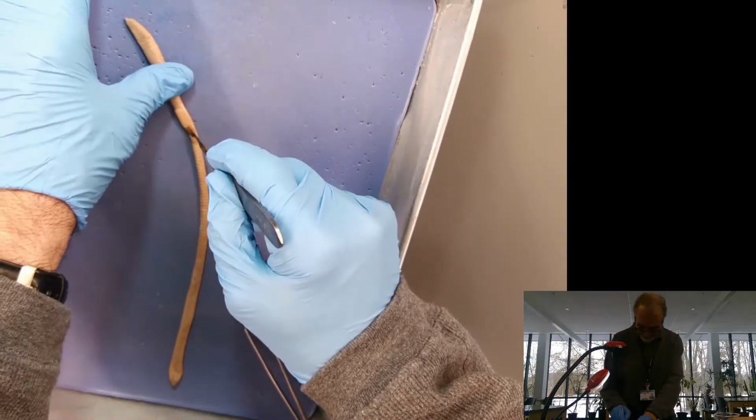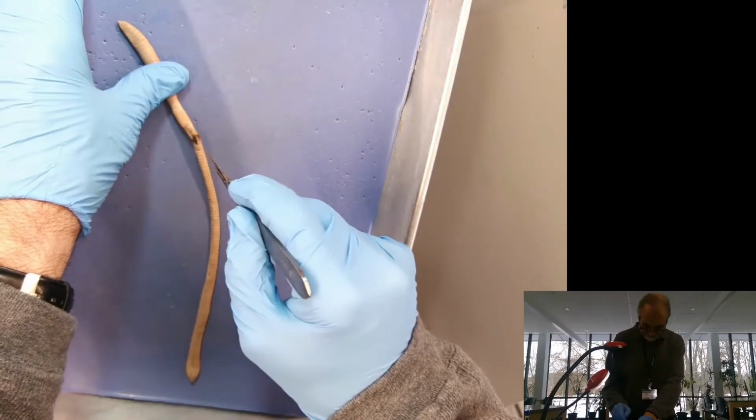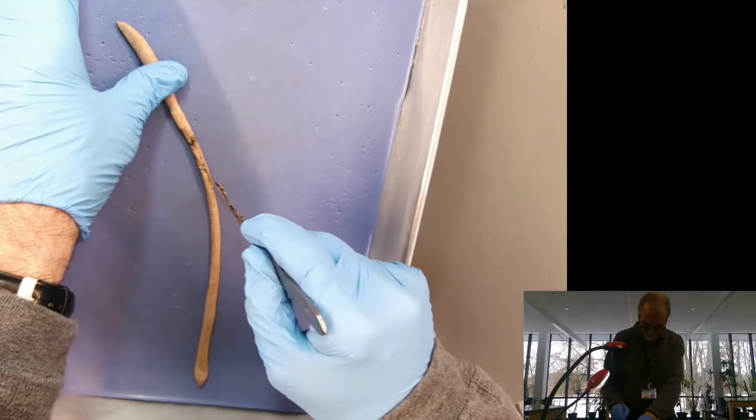So you said they exchange sperm. Does that mean that they're hermaphroditic? Mm-hmm. They are hermaphroditic. That is correct.